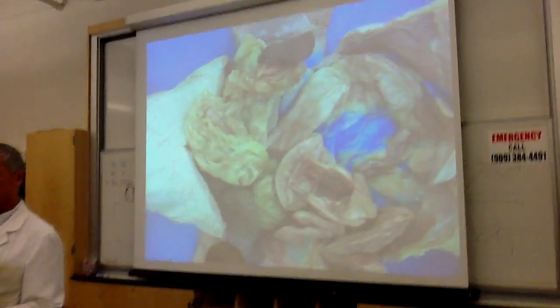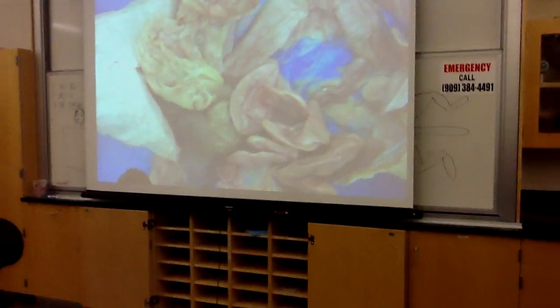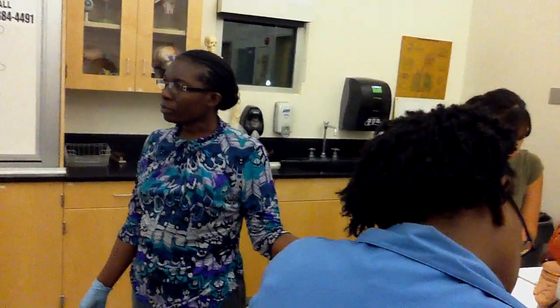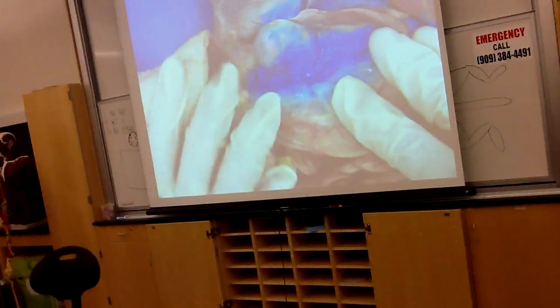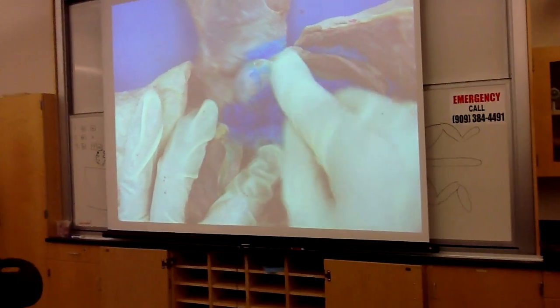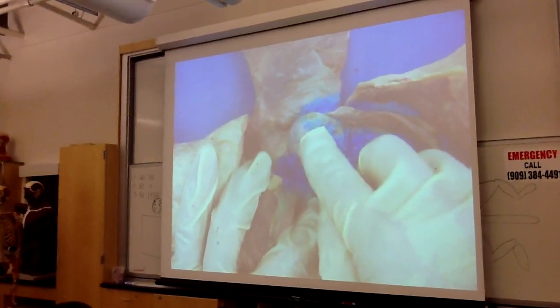Now, if we start down this other side over here, let's find some urinary structures. We've just found digestive structures. So, I'm going to take all this intestinal stuff and pull it toward me. And this cat had a vein explode, so blue stuff leaked all over the place. But if you pull the intestines towards you, you're going to see a big lump-like, sort of grayish organ right here on the back body wall.